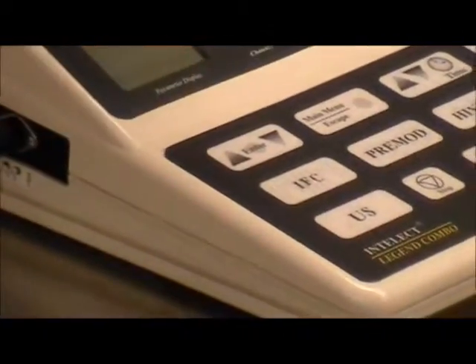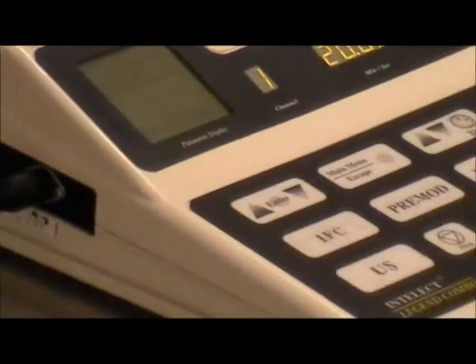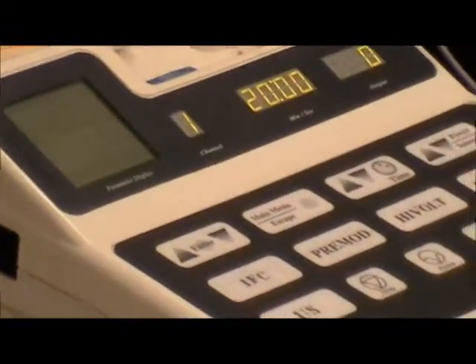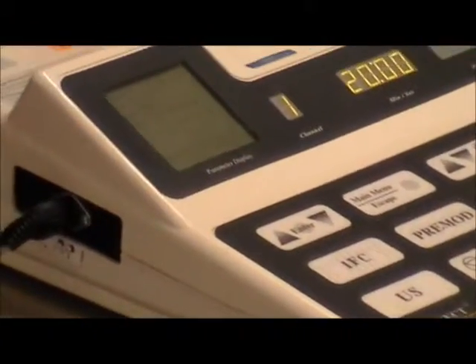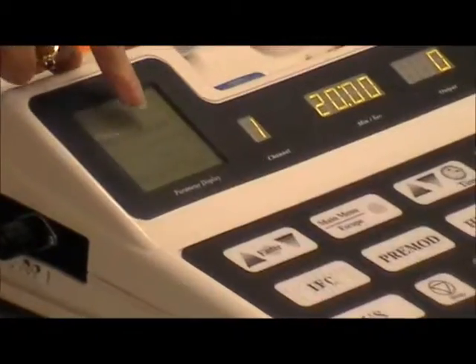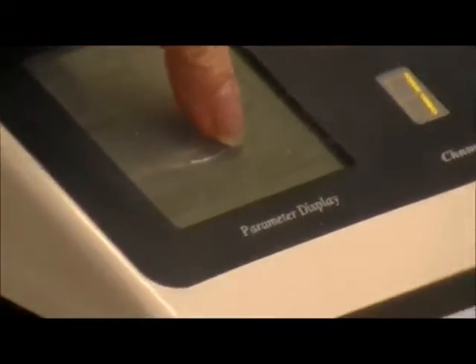Move that down. It then says amp mod. Amplitude modulation is what that's saying, but it's talking about whether it's scanning or not, okay? It defaults to 40% scan. So it will automatically do the interference with 40% of the area then scan. If you want other than that, you hit enter and it gives you your options. 40% scan, 100% scan, or static.